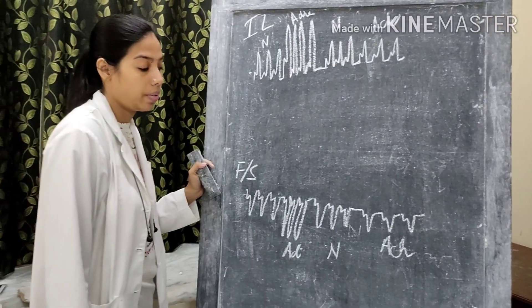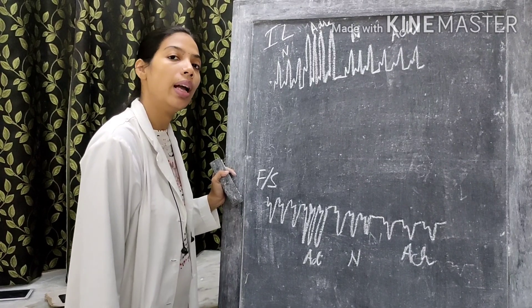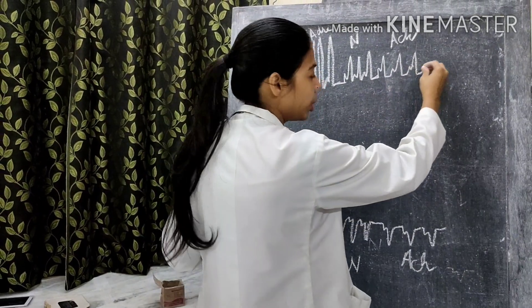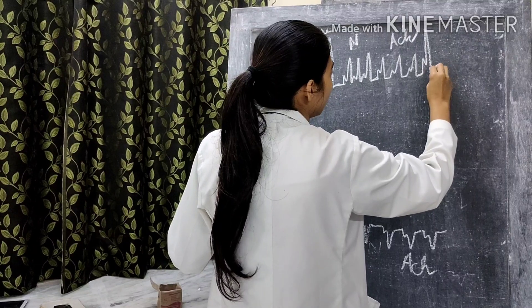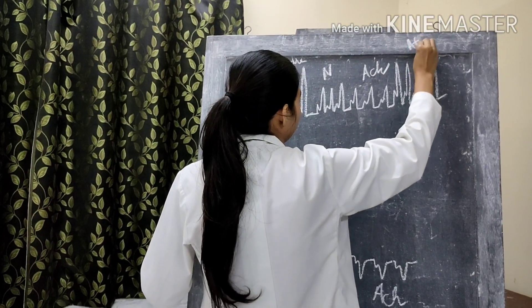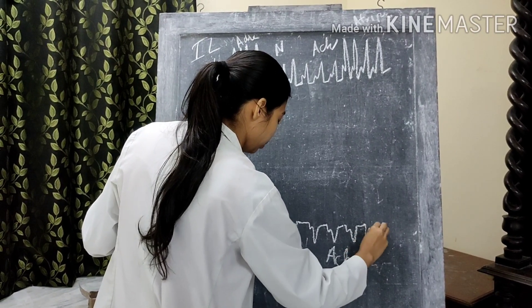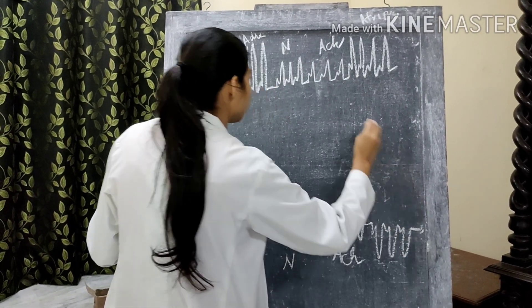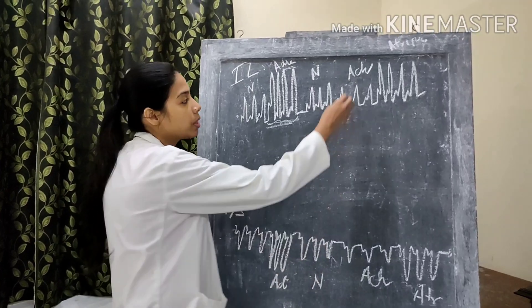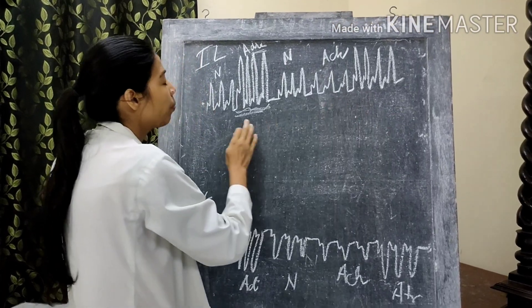After recording the effect of acetylcholine for 2 to 3 beats, we pour 2 drops of atropine. As soon as we pour atropine, we get a change in the cardiogram and we record that recording. After giving acetylcholine, we directly give atropine and we take its effect. Now let's see what the effects are.